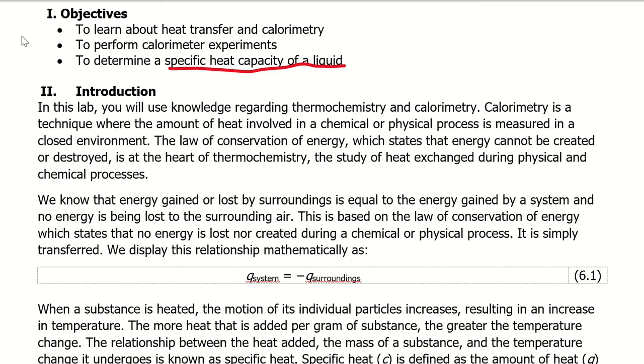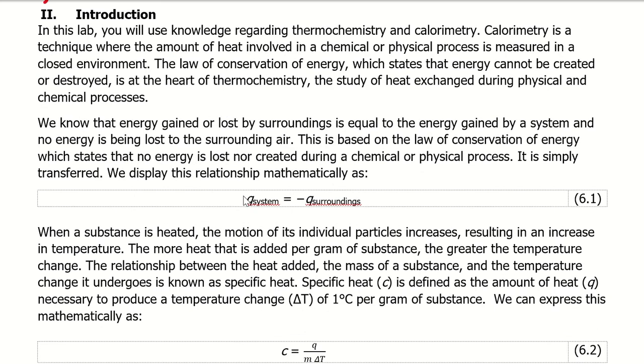So there are two major parts to this lab. As always, I like to split up bigger themes. You will be doing that calorimeter experiment, and then you will be determining the specific heat capacity of a liquid. So just to get that going in your mind, split it up into those two major sections.